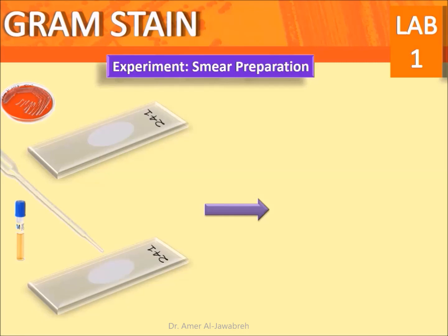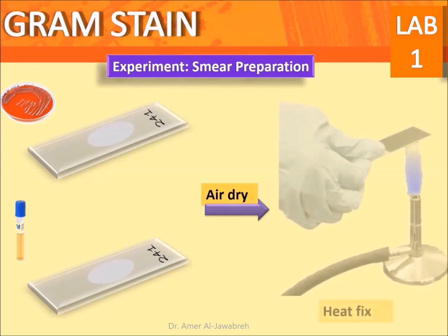Allow the smear to air dry, then heat fix by quickly passing the slide two times over the flame.